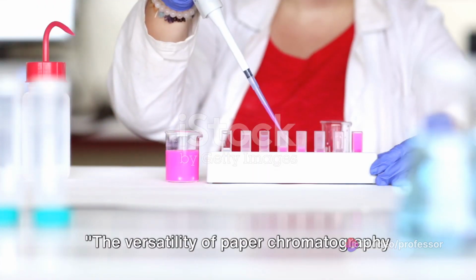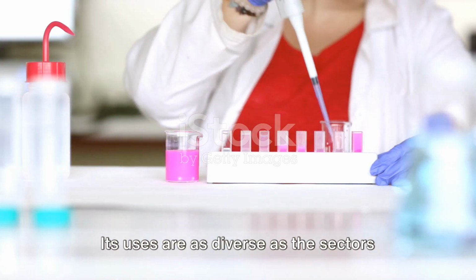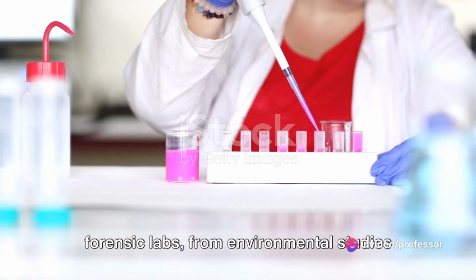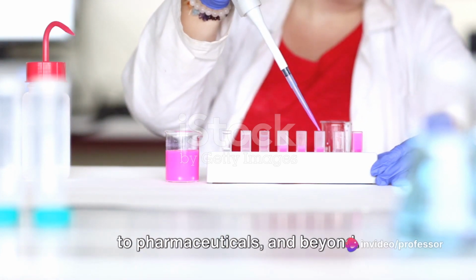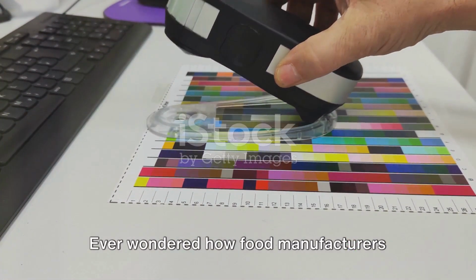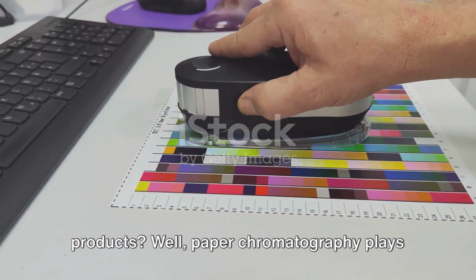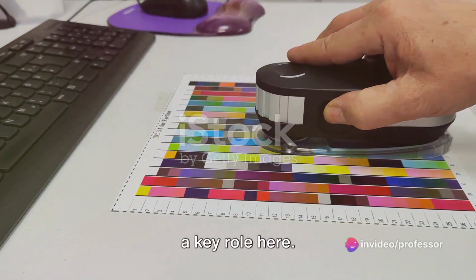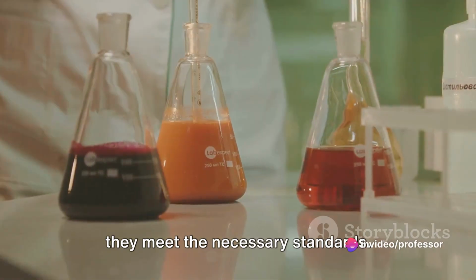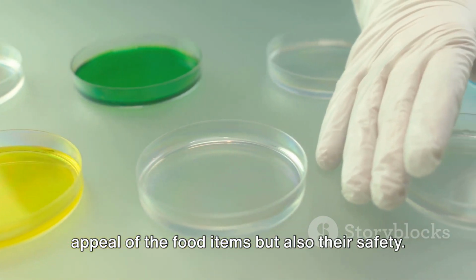The versatility of paper chromatography has made it a crucial tool in various fields. Its uses are as diverse as the sectors that employ it, from food industry to forensic labs, from environmental studies to pharmaceuticals and beyond. Take the food industry, for instance. Ever wondered how food manufacturers ensure the consistency of color in their products? Well, paper chromatography plays a key role here. It's used to analyze food dyes and ensure they meet the necessary standards. This not only helps maintain the visual appeal of the food items, but also their safety.